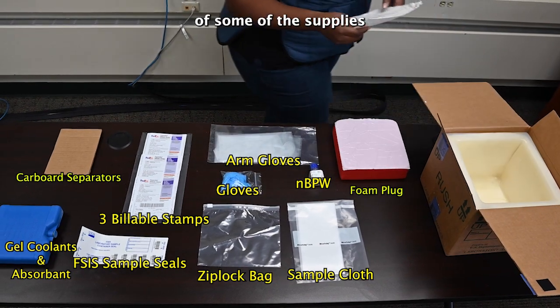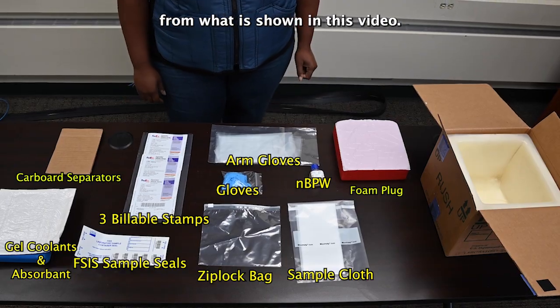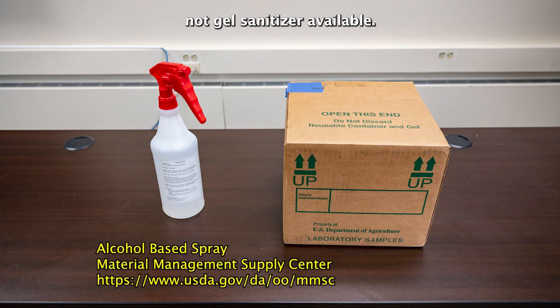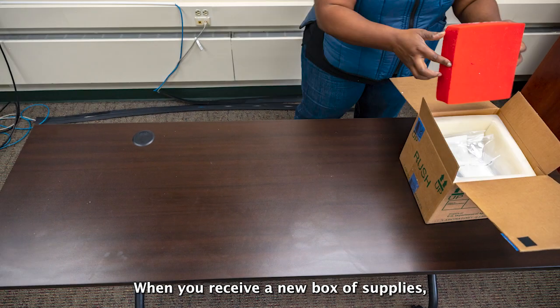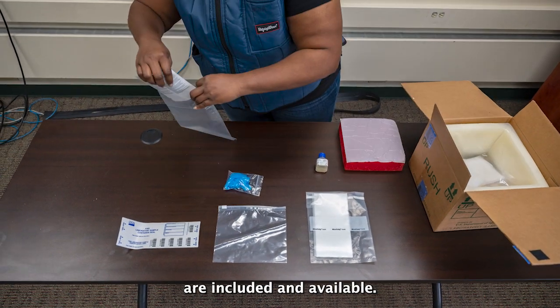The color and packaging of some of the supplies you receive may vary slightly from what is shown in this video. You're also to have an alcohol-based spray — not gel — sanitizer available. The sanitizer is not included in the sampling supply box, but is available from the FSIS Material Management Supply Center and will need to be ordered separately. When you receive a new box of supplies, first verify that all necessary supplies are included and available.